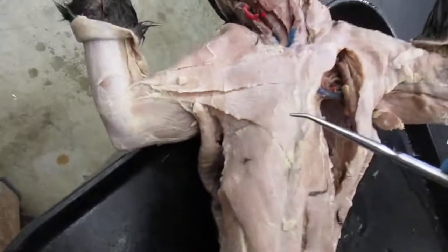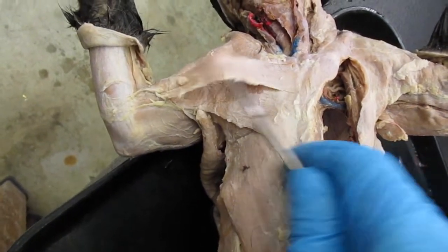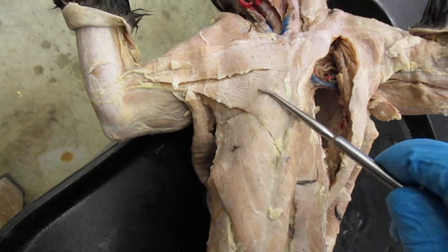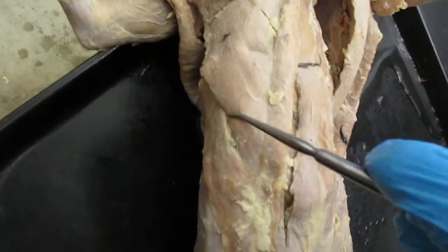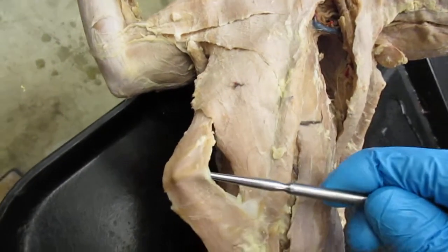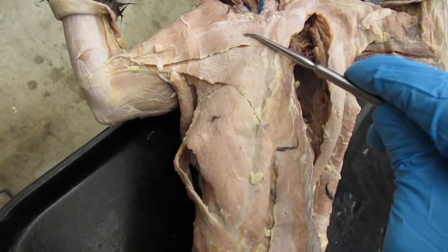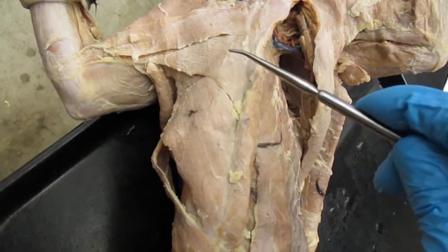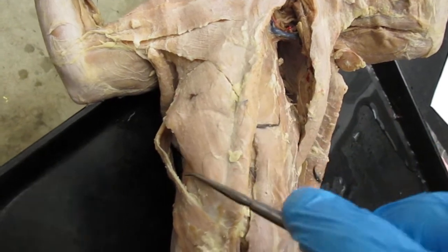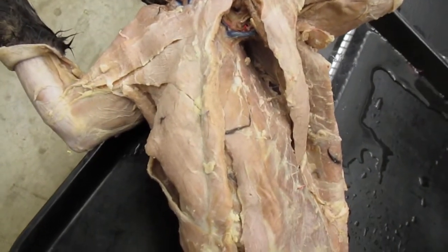Let me show you the same thing over here. So, right here, we see the pectoantebrachialis right here. Pectoralis major, minor, and then xiphihumeralis. This is the pectoantebrachialis, pectoralis major, minor, xiphihumeralis. Okay, so that's got that taken care of.